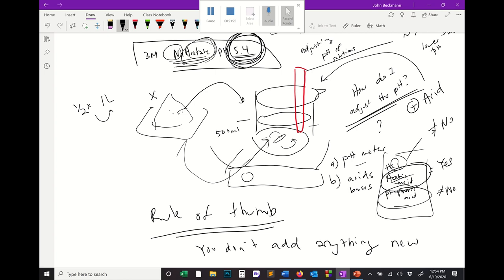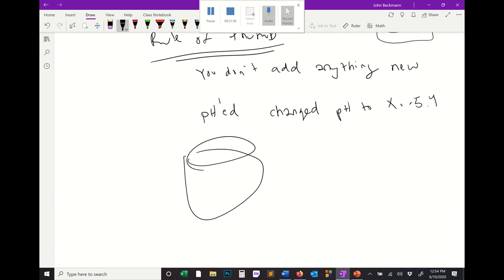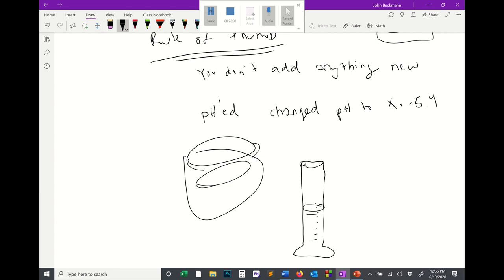Okay, so then you'll take a little glass pipette of acetic acid and you will drip acetic acid into your new solution until the reading on that pH meter changes to 5.4. Then, once it's been pHed, this is a verb, pHed, that means you changed the pH to whatever you wanted it to be. In our case, it was 5.4. Once that's done, you take that beaker of solution and you pour it into a graduated cylinder, okay? And it should be about half of the volume that you were originally intending to make.